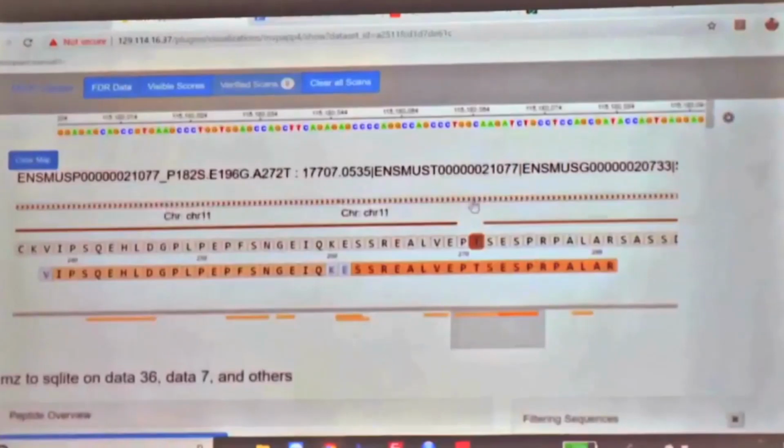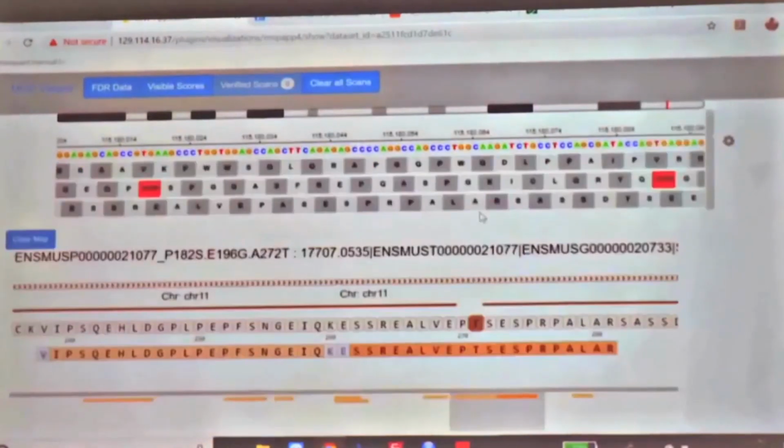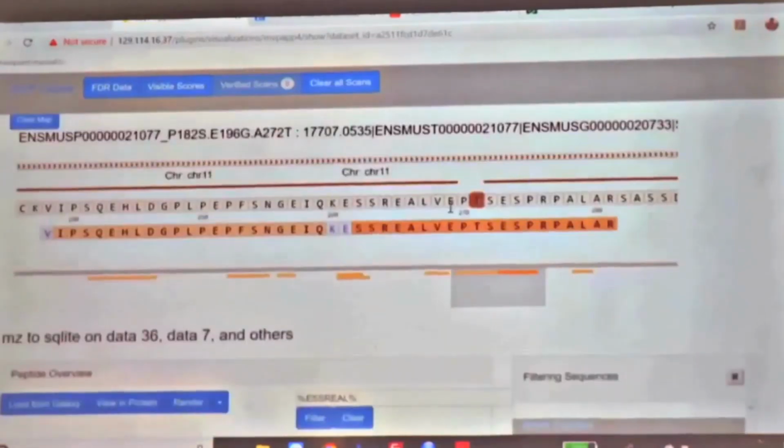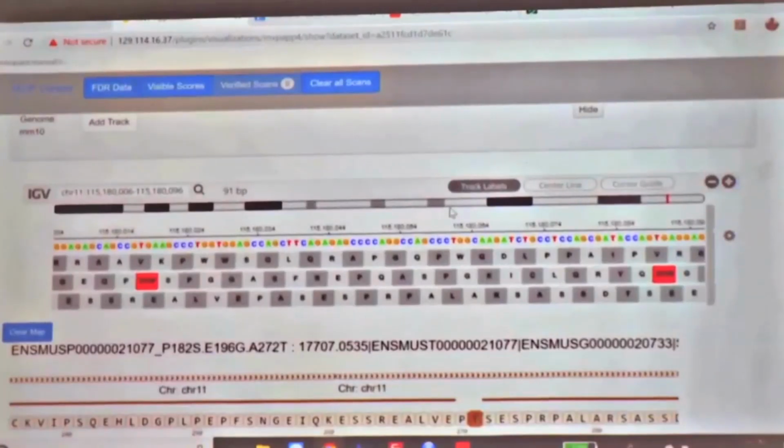There are ways that you can look into this. You can expand this and look at the 3-frame translation of that particular peptide. You can see that the peptide is here, in the 3rd frame. Again, this is for one peptide, but if you had 200 peptides or many peptides, you should be able to see that.